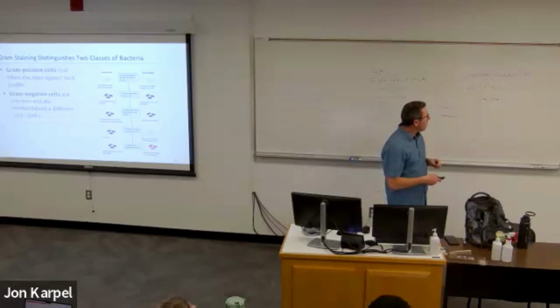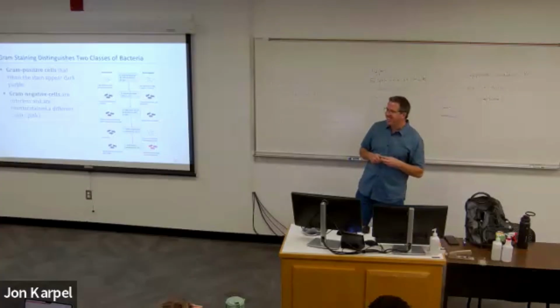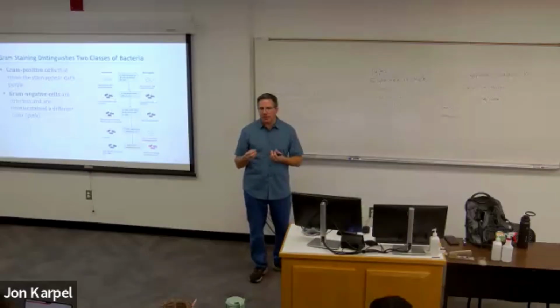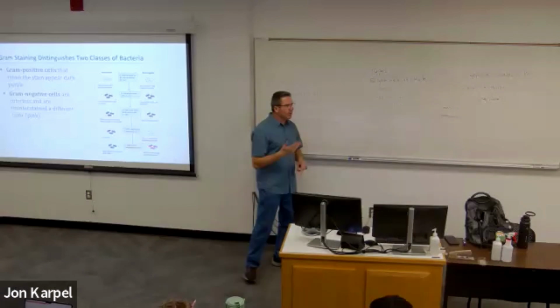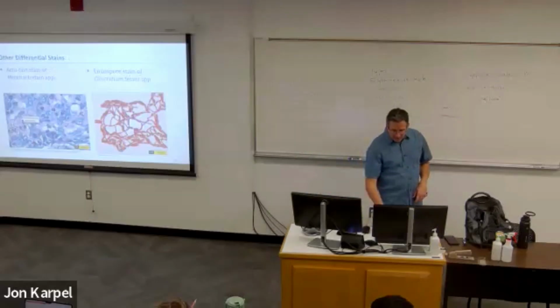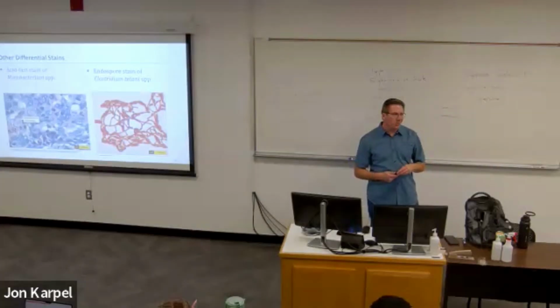And just as an early reminder, anytime we're doing staining in lab, don't wear your favorite clothes. Okay? Because stains are staining. So they can stain clothes. Sometimes if you get them on your hands, they'll be there for a few days. They won't kill you, but you'll have purple fingers or something. But we have gloves in lab. We'll hand out lab coats next week as well. So that'll help protect you a little bit. But gram stains are kind of fun, and it's kind of exciting. We'll use that as part of our identification process when you do your unknown.